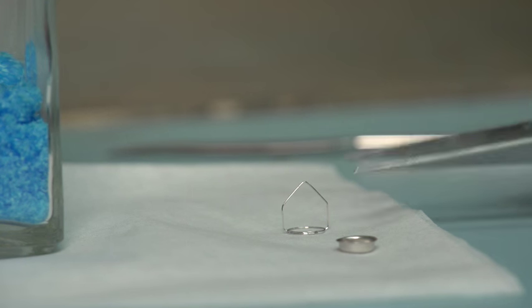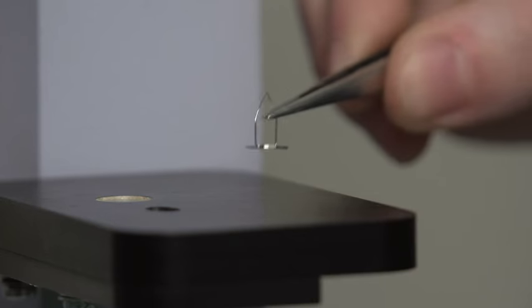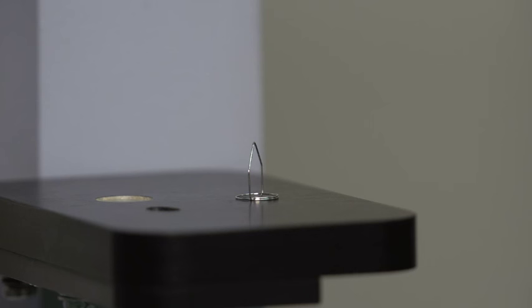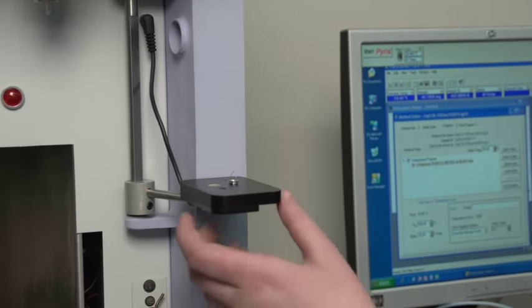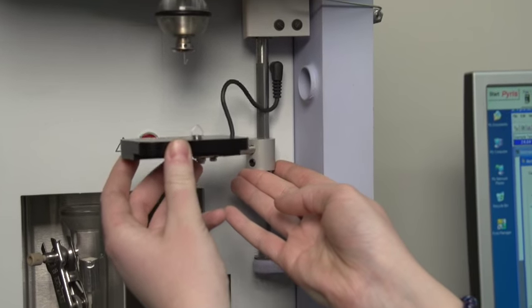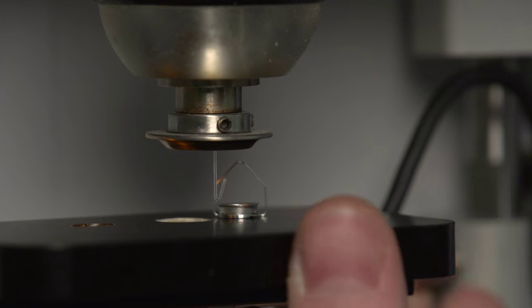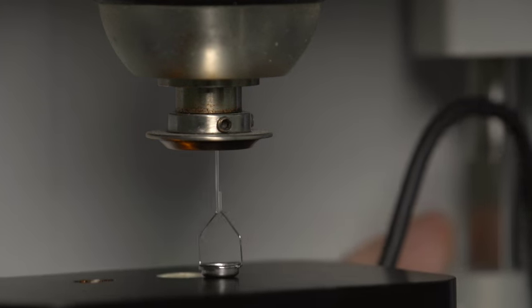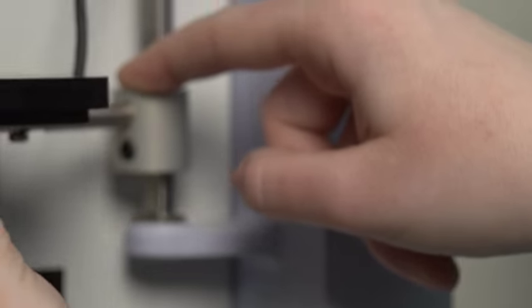Using the micro forceps, place the stirrup on the platform. Carefully put an empty pan into the stirrup. Do not squeeze the pan as it will lose its shape. Raise the platform so that the stirrup is just above the height of the balance hook. Push the stirrup and pan over the hook and lower the platform. Rotate the platform out of the way to the right-hand side.